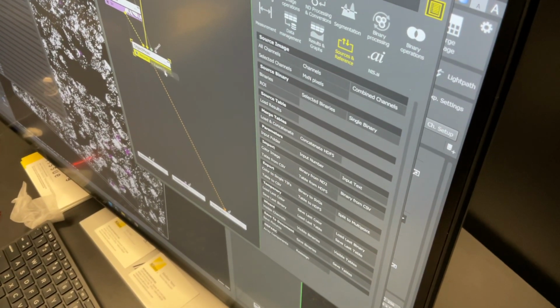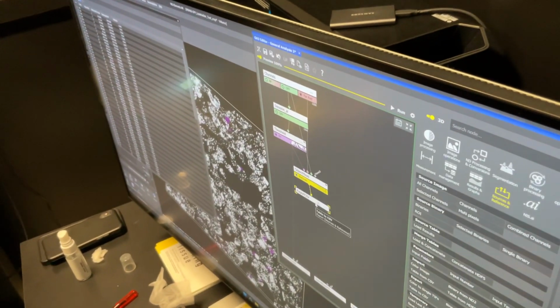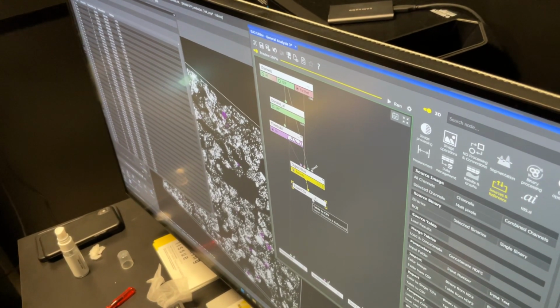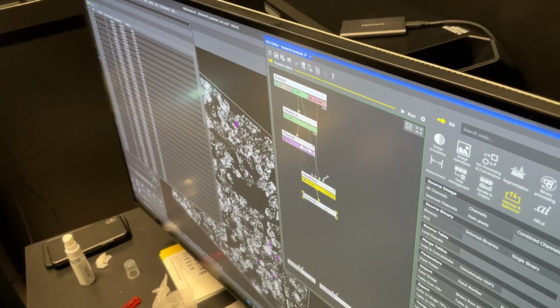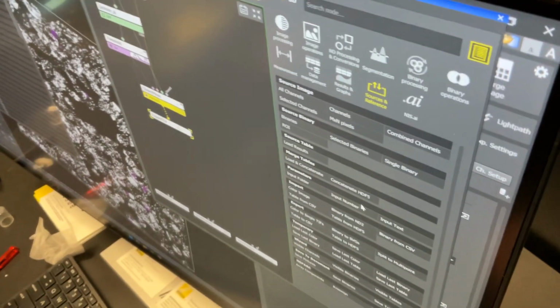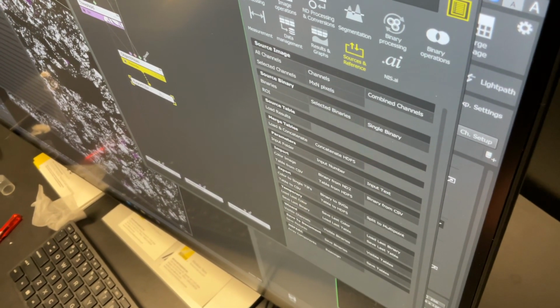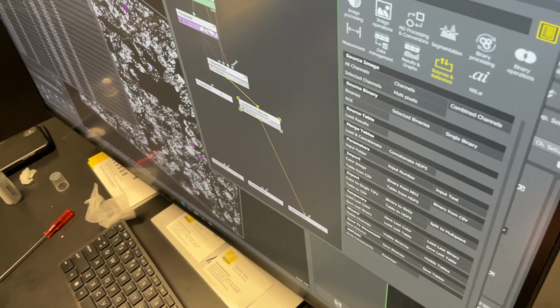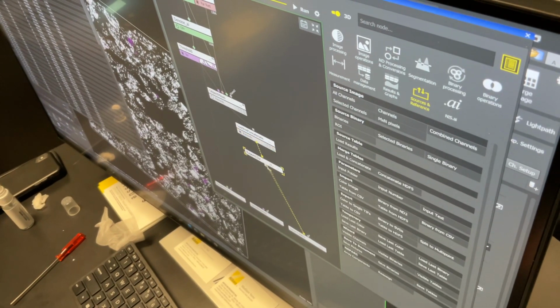You can build it right in. Oh, that's easy. And then the last thing that's actually critical, when you have multiple files on multiple images and you want to run the batch process and you want everything in one file, is the, where is it? They keep moving things on me. Load and concatenate. You'll need that as your very last step.